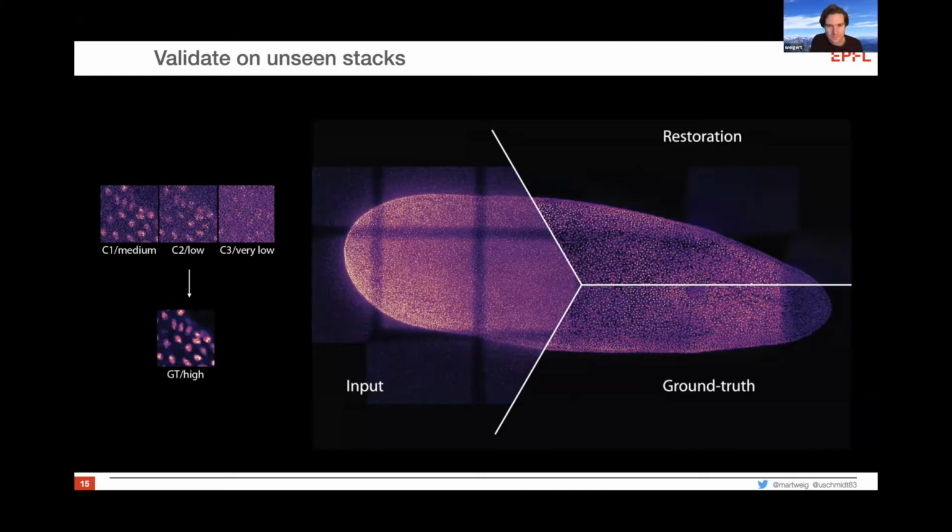Doing that, could you use that for segmentation in one step? Exactly. If your final goal is segmenting with something extremely powerful and where you have annotations already, you could do that in one step, right? A segmentation network, essentially regressing on the pixel values, is a way harder task than just finding out is it inside or outside of a nuclei, right? So this is an easier task because the network could just learn a content-aware threshold. And in some sense, if you only want to do this, it's way better to just directly segment noisy data. So this will always work better than if you regress on the actual pixel values, right? So if that's all you need, I would just right away segment.